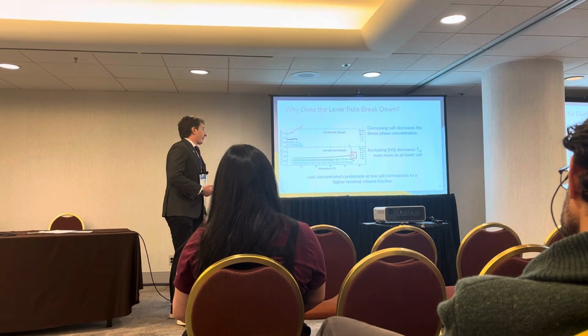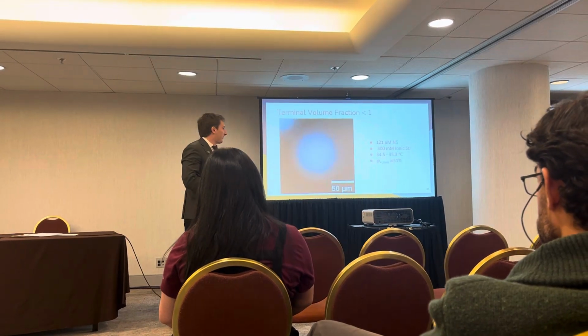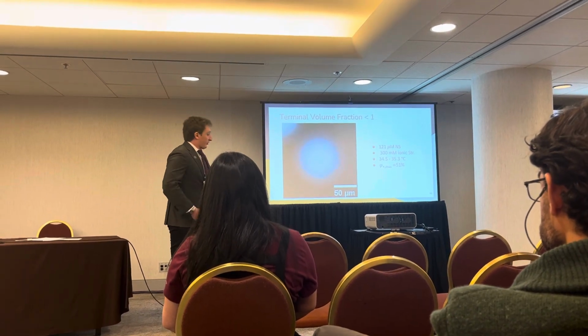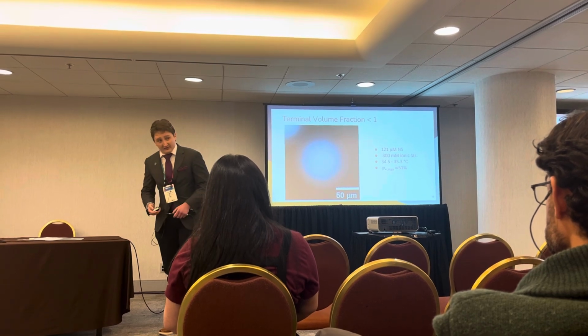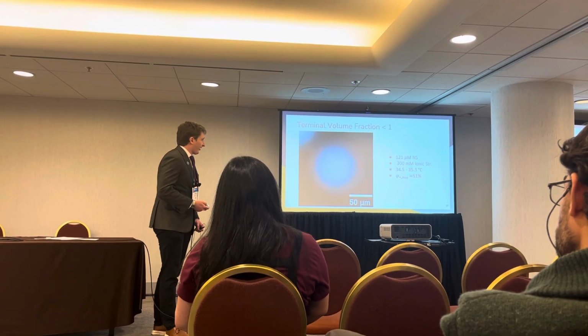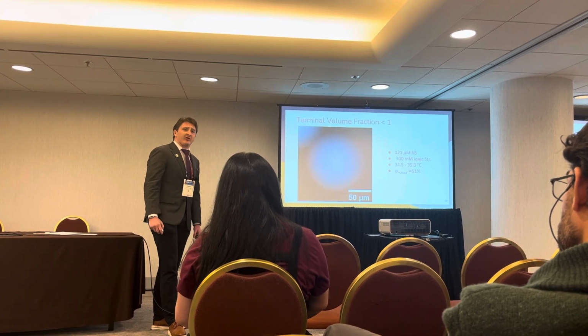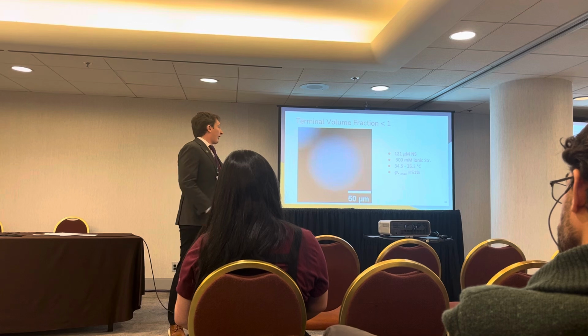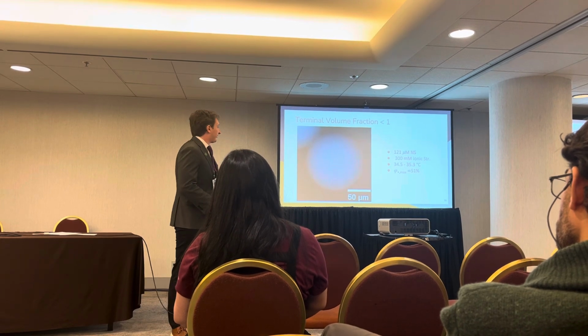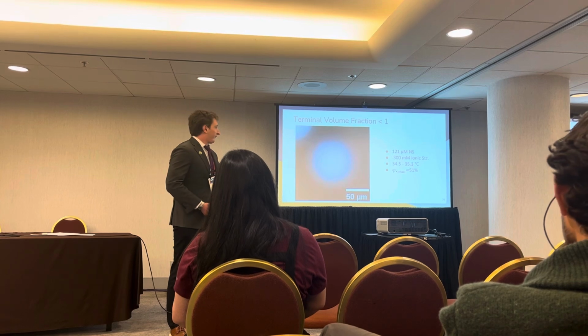So let's take a look at what's actually going on in this specific movie over this specific temperature range. You'll see that we have an emulsion that is in a stable heterogeneous configuration. And yet as I increase the temperature over about 1 degree Celsius, we watch this volume fraction simply disappear. It never swelled to a volume fraction of 1. It simply just dissolved to a homogeneous phase. I'll show you one more time, just for clarity.